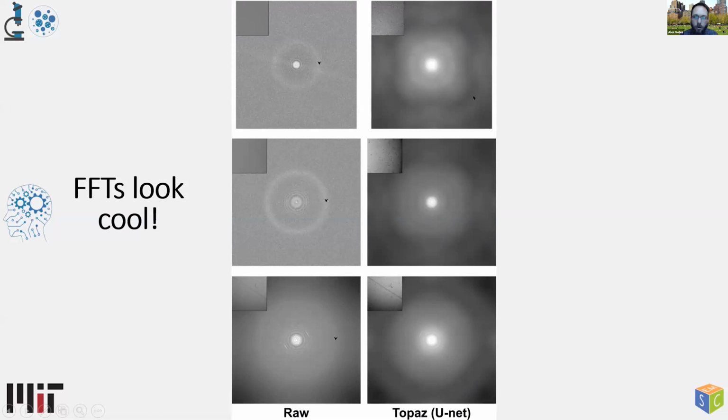And so maybe you shouldn't trust any information out there, but really you shouldn't be using denoising to do anything past the initial analysis step of your micrographs and particles and helping to pick.